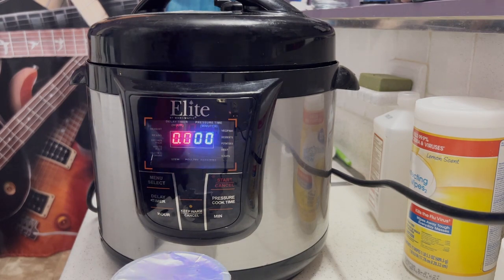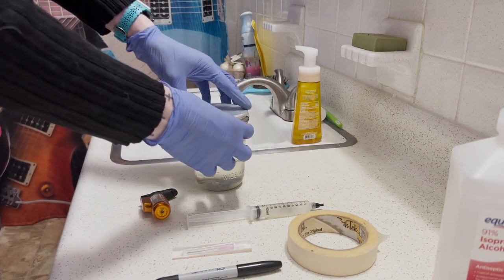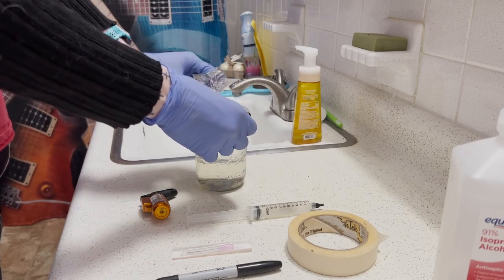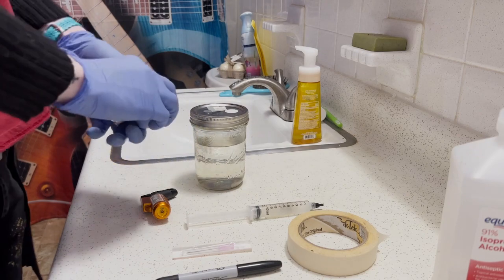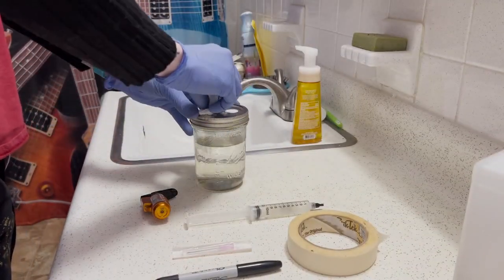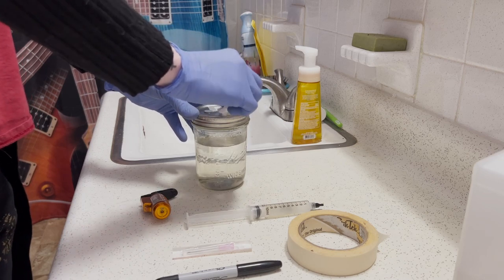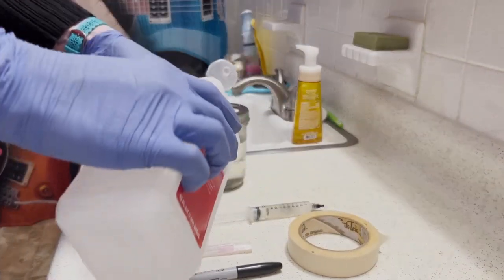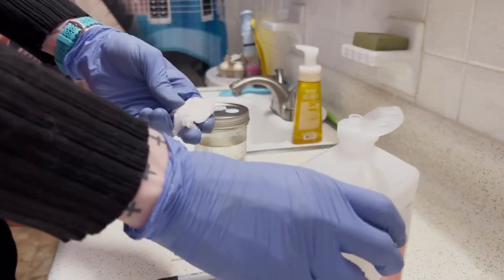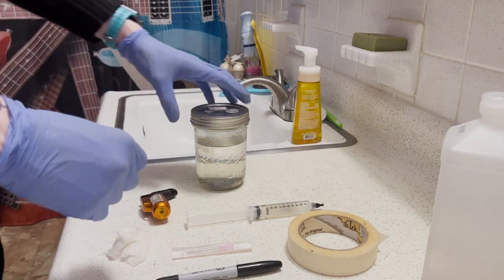The next step is going to be the inoculation. You can see I have my room-temperature culture jar. You want to make sure you really let it cool to room temperature — if your culture is too hot, you could potentially destroy your genetics, and that's something you really don't want to deal with, especially at this early stage before you've even started with your spawn. Some condensation from underneath the tinfoil is still there, so I'm wiping that off and being as clean as possible. I've got my rubbing alcohol ready.